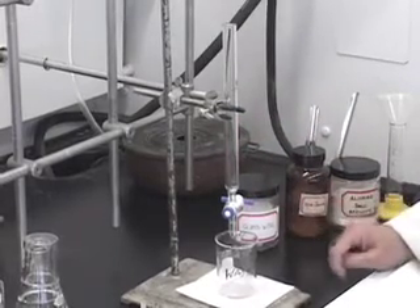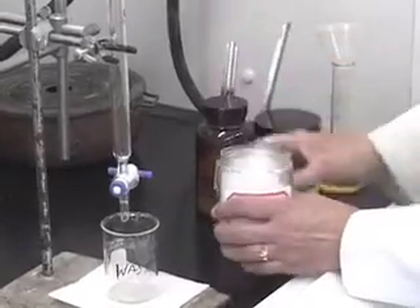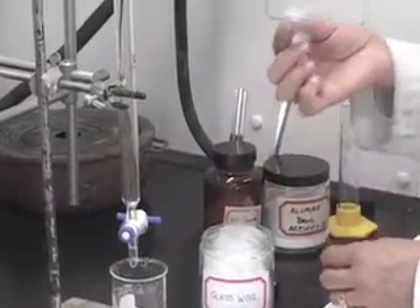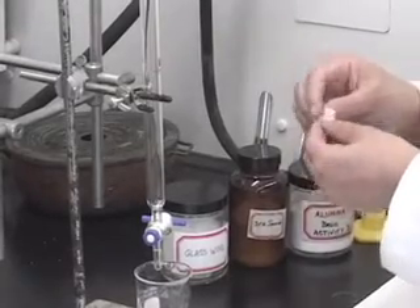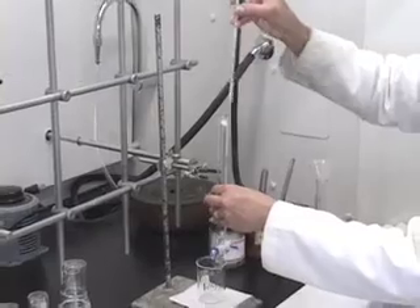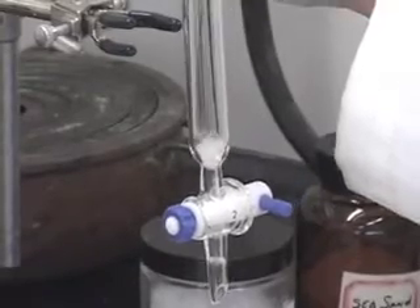If I add solid to this column, there is a hole here that will get clogged by the solid adsorbent. To avoid that, what we do is insert a piece of glass wool. Just take a tiny piece of glass wool — and by the way, glass wool as the name suggests is made out of glass. This is glass that you are touching but it is very soft. Press it into a tiny ball and drop it in.